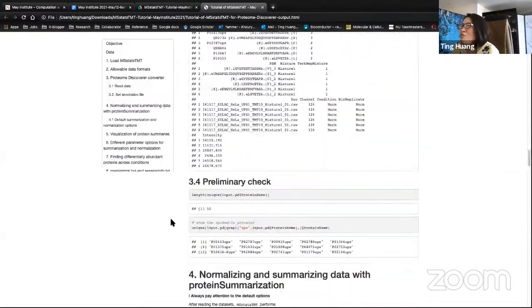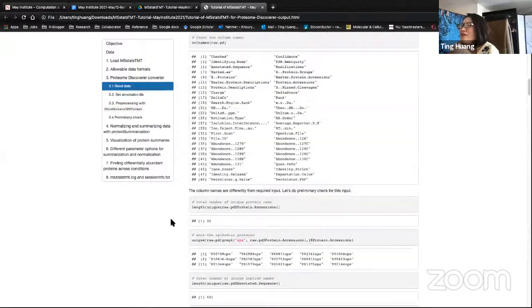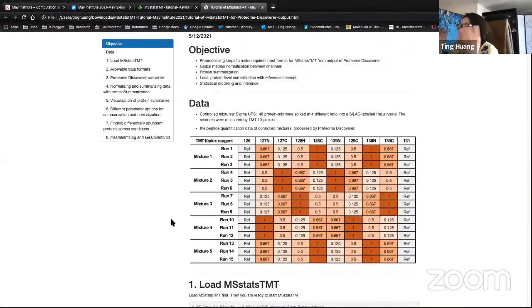Actually, there is no upper limit for the reference channels. If you have many empty channels, you can use as many as you want. But in my experience, the performance increase from using more reference channels is very slight, very small. If you have empty channels, I would recommend putting more real samples instead of reference channels. One reference channel is enough for most cases.